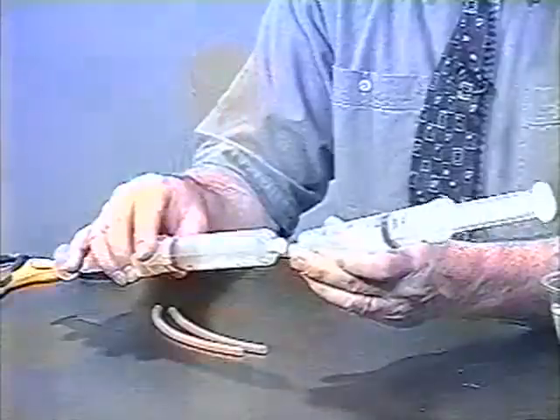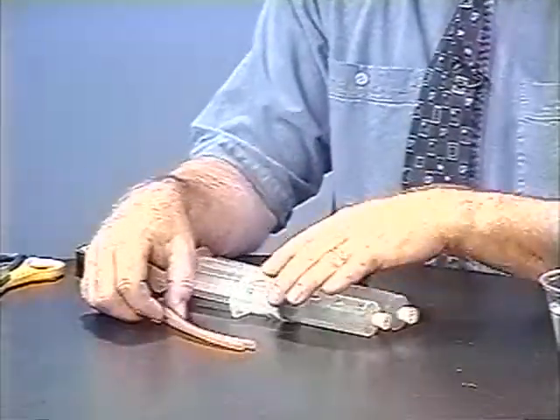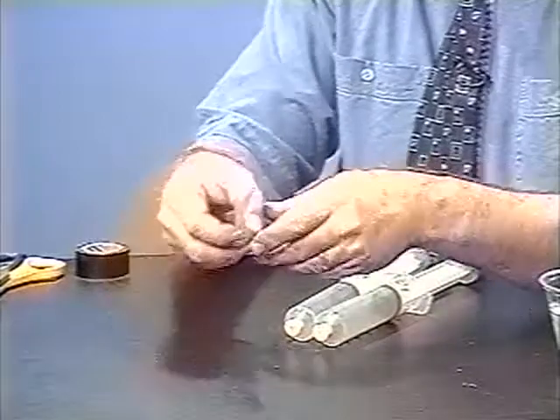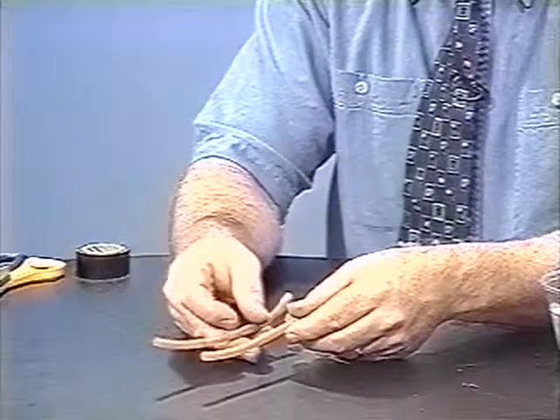The final technique of gas transferring that we'll talk about is the simultaneous transfer of two gases. For example, acetylene or ethyne and chlorine react violently with each other, and we couldn't transfer them from one syringe to the other — that would be dangerous. But we can transfer them simultaneously underwater using two latex tubes.